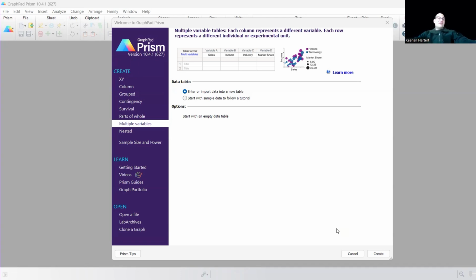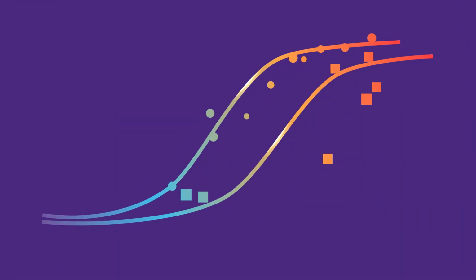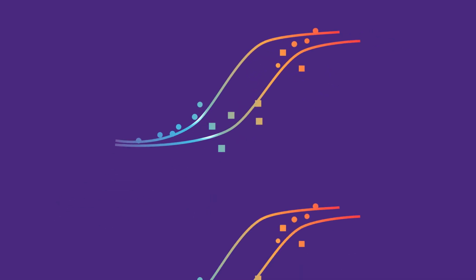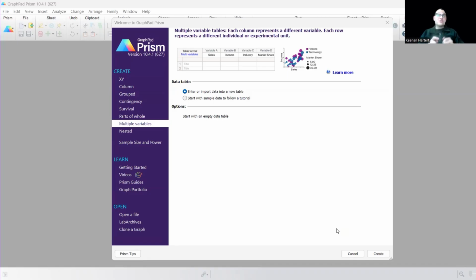The main stuff that we're going to cover today: we're going to learn how to partition the data that we have into specific clusters backed up by stats for how many clusters they actually go into. And that's the difference with hierarchical clustering, which is a previous video you might have watched. We're going to group these similar observations and identify some basic patterns using k-means, one of my favorites.